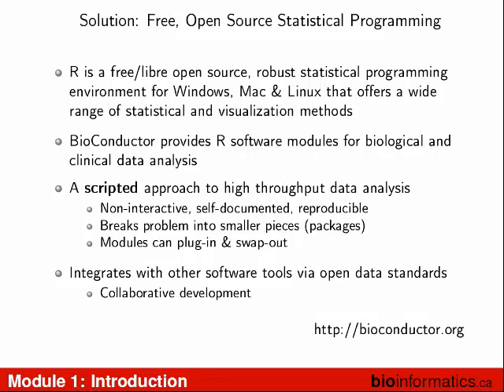The way it solves the problem is we break it into smaller pieces. I'll describe that a bit more on the next slide. The tools that we develop solve one problem. They solve it really well. And then it goes on to the next step, and another tool is developed. We're not developing some mammoth program where the whole idea is, here's my data, and I want to do discovery, and this one program does everything. No, we break it into quality assurance, gating, transformation, and one tool is doing each of these little steps along the way. It's all open software with open standards, which means it works really well with collaborative development.